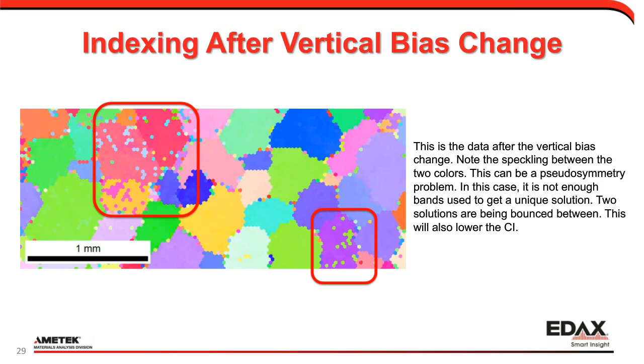Now, in general, this is going to be a common problem if I don't have enough lines. I also will see the speckling if I'm doing a hex-based material and I keep it to a relatively low amount of lines. And you'll see that later on too.